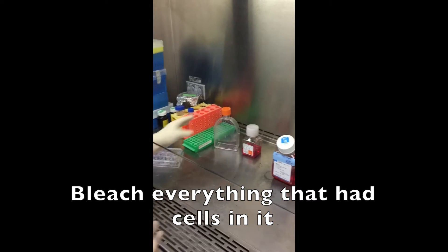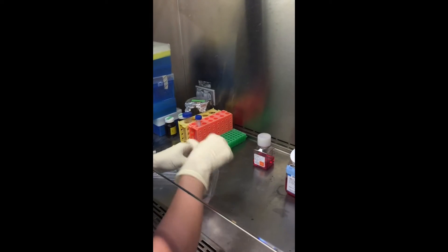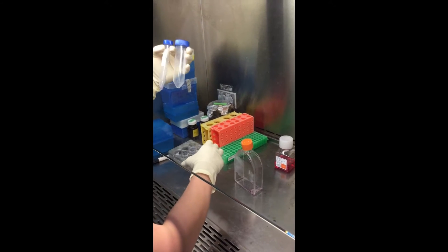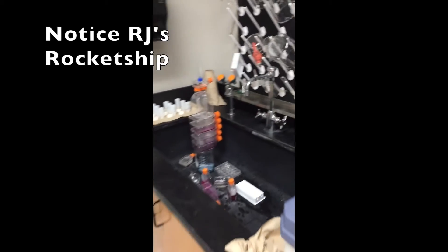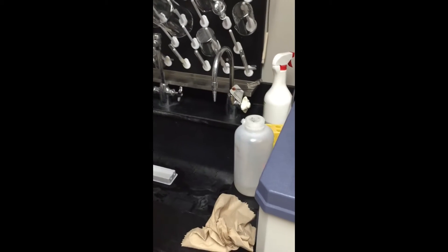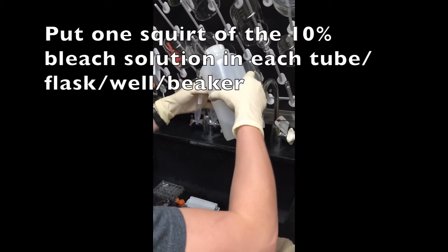You need to bleach everything that had cells that you're done with. So the old flask, even if it has some cells in it, we need to bleach it — and anything else that had cells in it. So you could have centrifuge tubes, plates, flasks, and even the beaker with tips. We'll go over to the sink where we have our ten percent bleach solution. All you need is a little squirt in each thing.